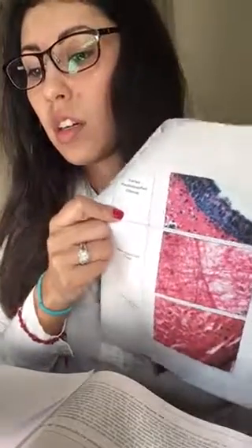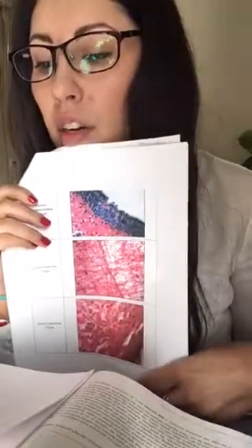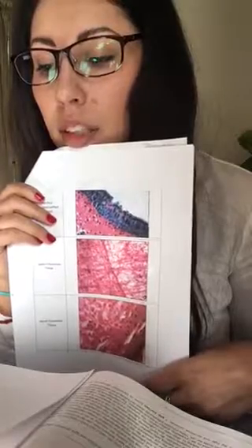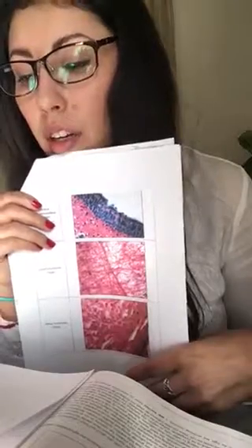Number 31, view the photography of the trachea provided in the supplement document. So it would be right here. Observe the layers of the pseudostratified ciliated tissue of the trachea. Copy the slide of the trachea and put it on there.